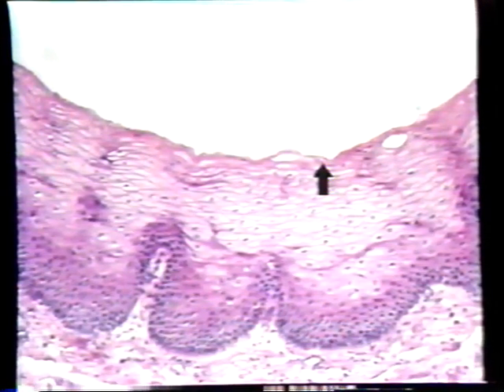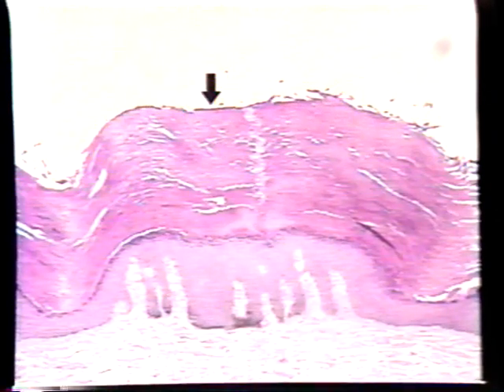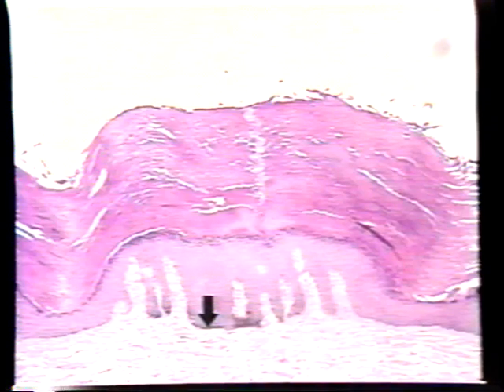There is also a kind of epithelium called stratified squamous keratinized epithelium, and we will look at that in the next image. This is a light microscopic image of a very good example of stratified squamous keratinized epithelium. Here the epithelium is extremely thick. The arrow is pointing to the surface of the epithelium here. The outside world would be up here, and the base of the epithelium is all the way down here. The base of the epithelium is purple, and the pink material upon which it rests is connective tissue, and this tissue sample is palm skin from the monkey.